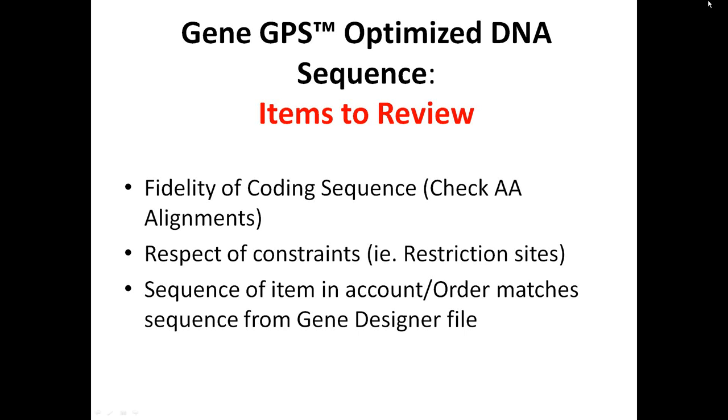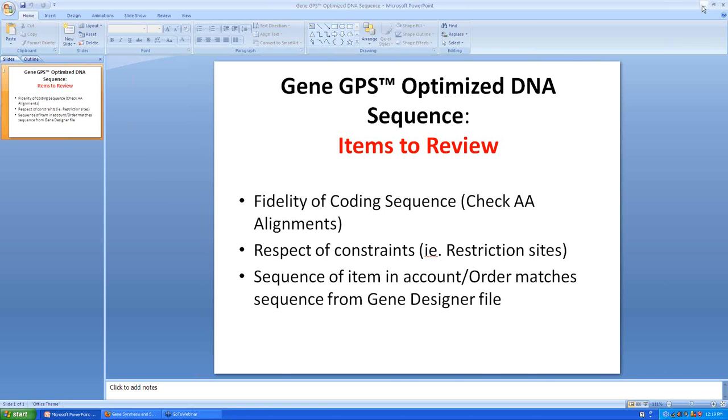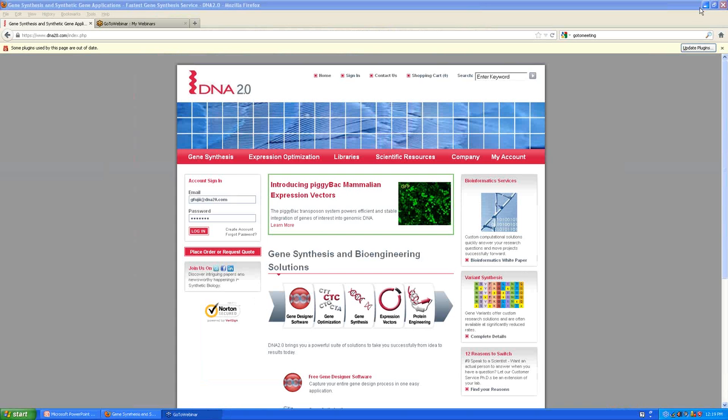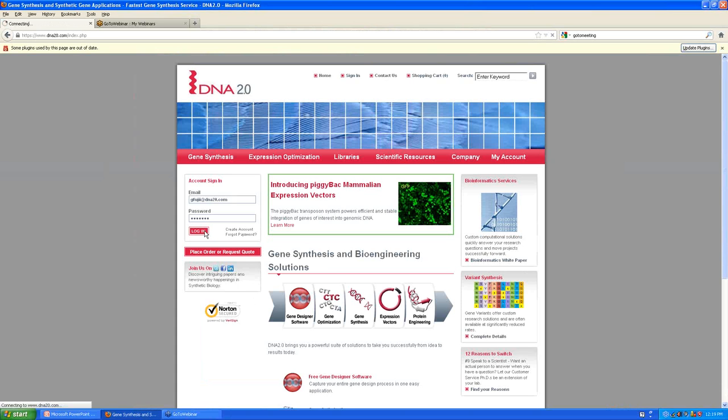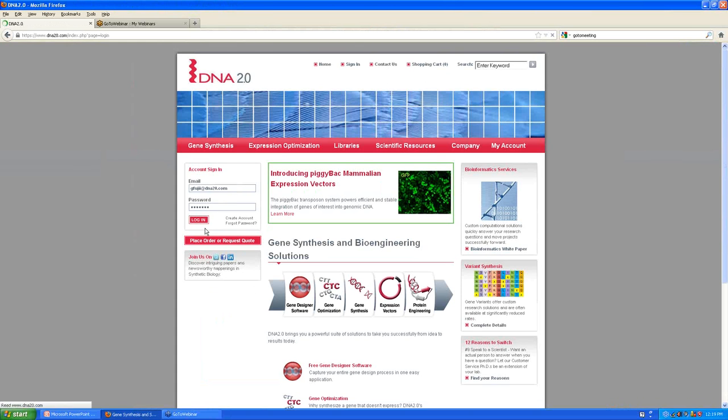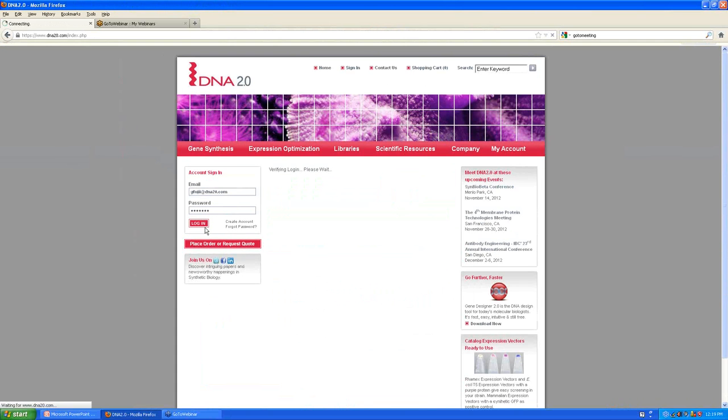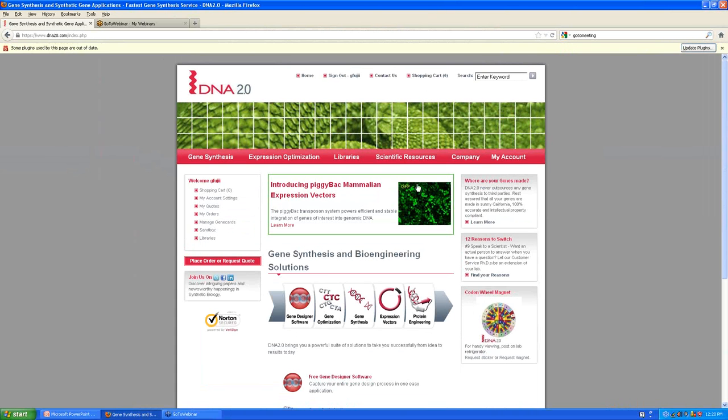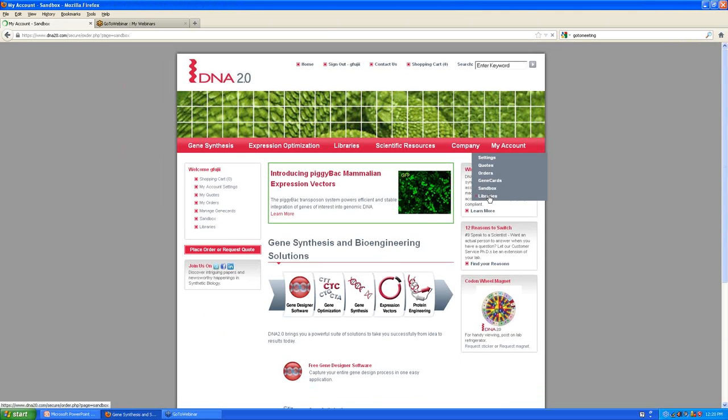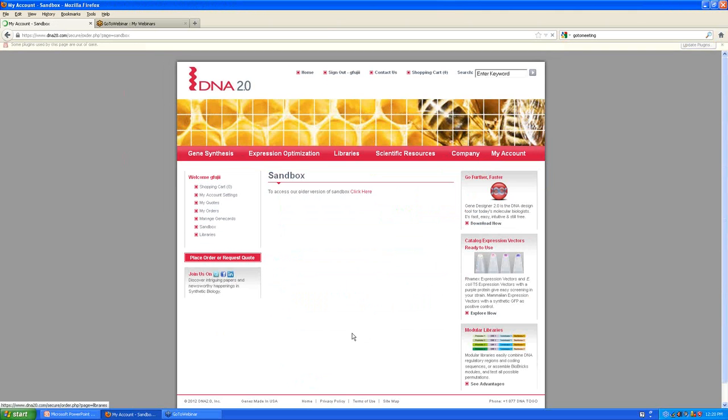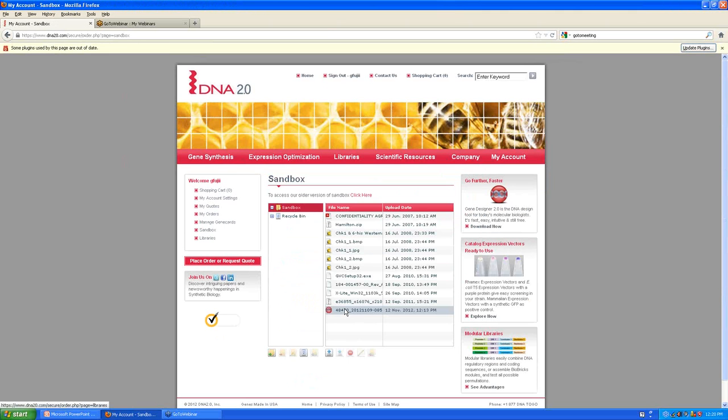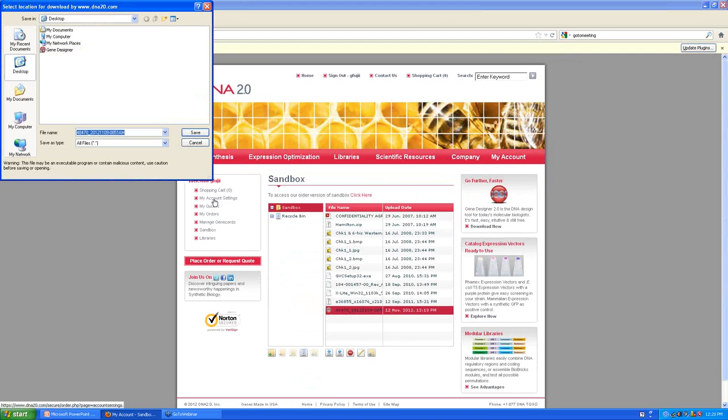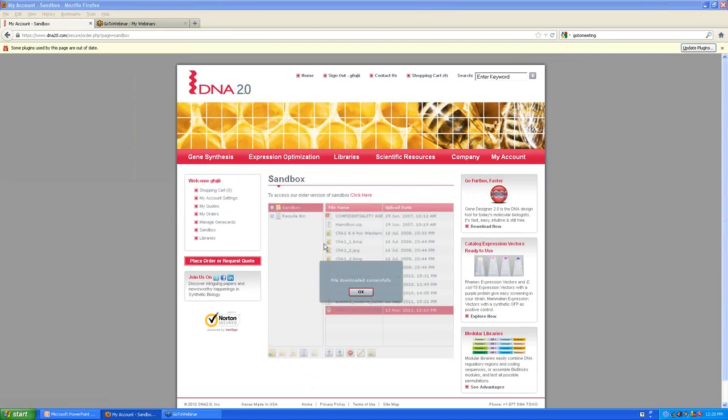So with this in mind, let's go ahead and go to our online account as I've been notified that within my online account sandbox I will find a gene designer file that has the optimized sequence. So there it is. And I'm going to download that to my desktop.